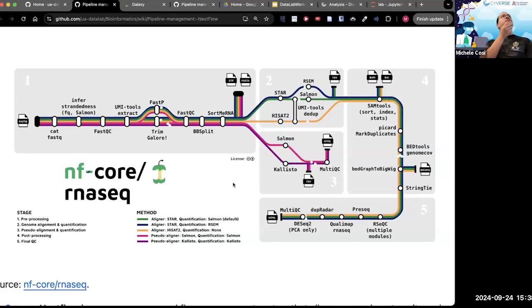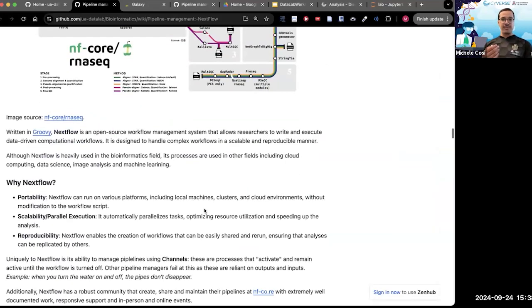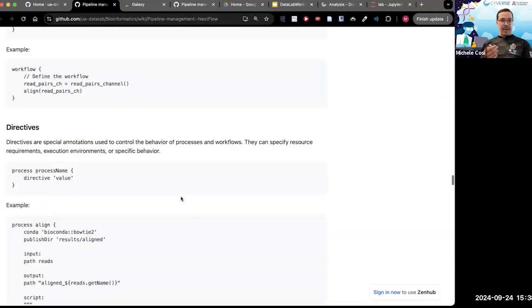I don't remember ever running a single Nextflow file which has like 4 different steps. I've always been able to run a single Nextflow file with all of the channels and, quote unquote, stages ready to go. So okay, I'm gonna make this smaller, and I have digressed.